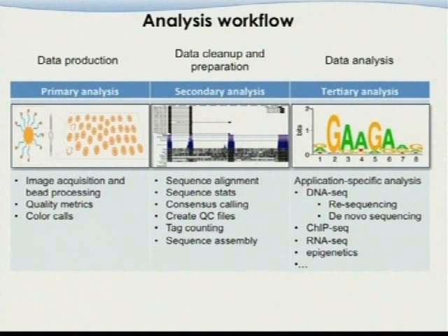And for the epigenetics and for the DNA methylation, how do we further analyze the data? Most of the bioinformatics part really needs to work together with the biologists to make sense of the original data. For the biologists, especially the students from the School of Medicine who come here, this part sounds like it's not important. And true, this part is something you do not have to run. The bioinformatician will generate it.